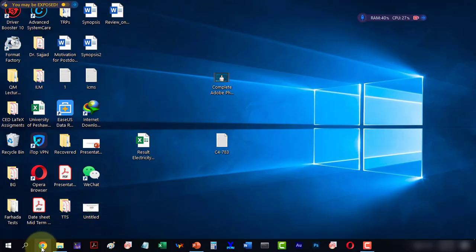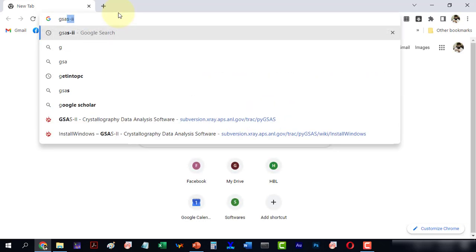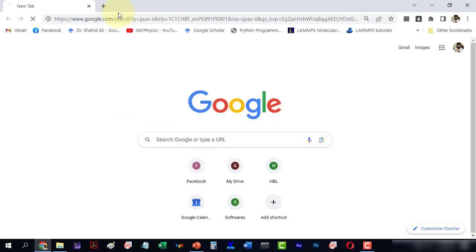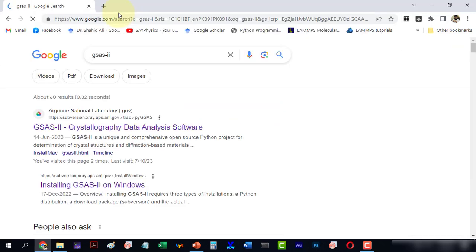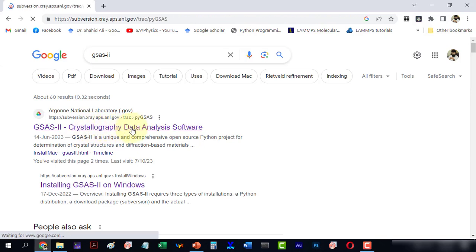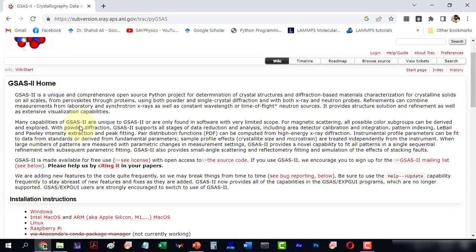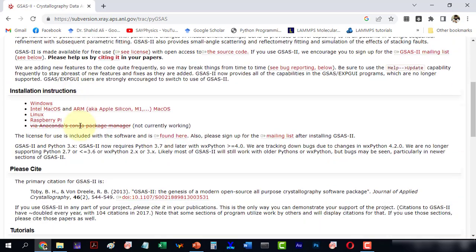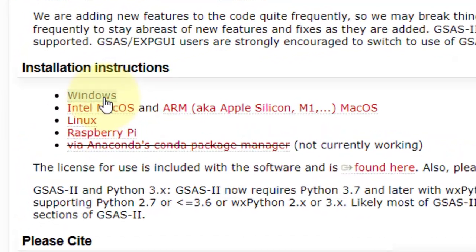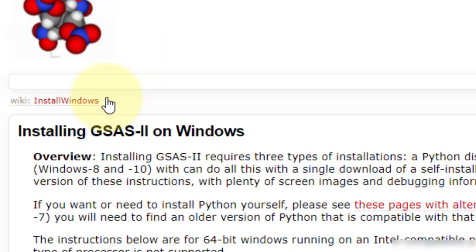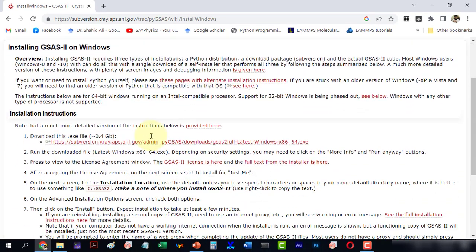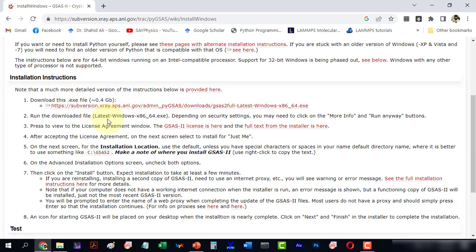First go to Google and type GSAS, then head to the website. Under the installation instructions for Windows, go to the downloadable file. All the instructions are provided there and I will guide you step by step.